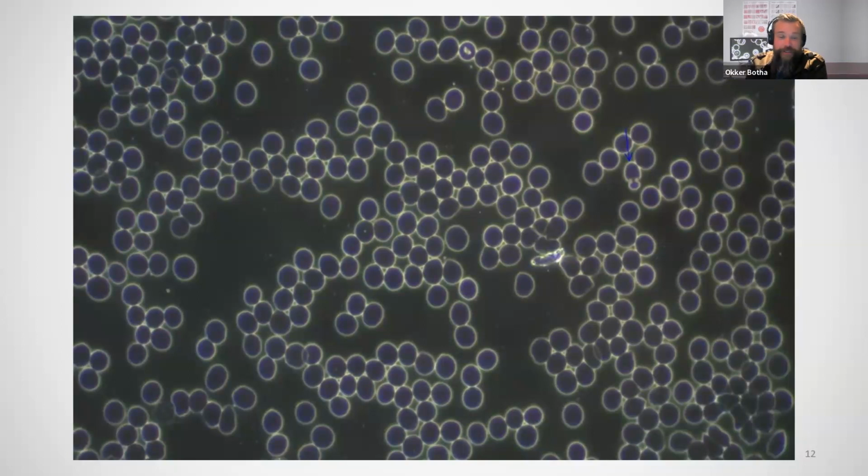So we have another image here. Also, I think quite obvious by now that it's not a great dark field image. Again, the clarity is lacking. We're not really seeing anything between the blood cells here, and you'd end up just guessing what might be there, and what you might be missing as well. Also here, the magnification isn't what it should be.